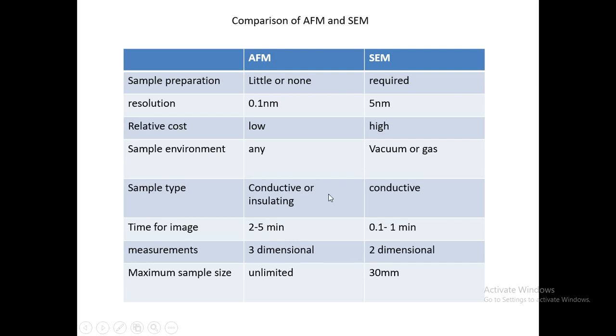So we discussed three types of microscope: the optical microscope, the scanning electron microscope, and the atomic force microscope, where each one utilizes its own working principle. The optical microscope uses light as a source for obtaining images, the scanning electron microscope utilizes an electron beam as the source, whereas the AFM utilizes atomic force, and by using the probe in contact with the sample surface, it gets the images of the required nature. So that is what I wanted to explain about this concept of microscopy.